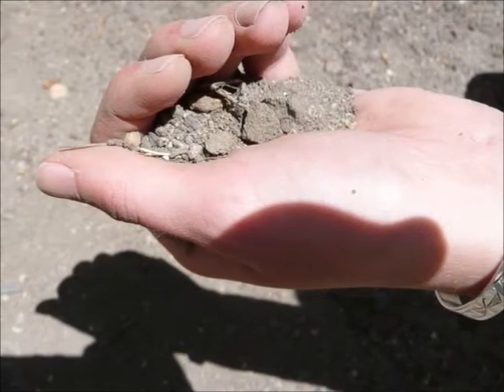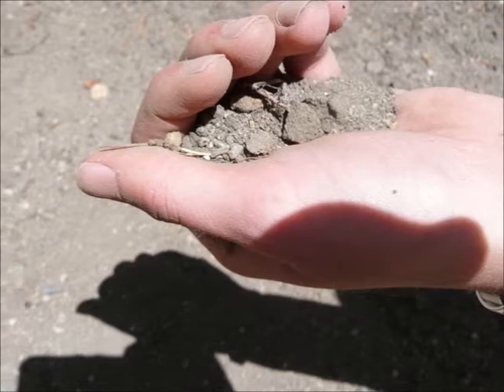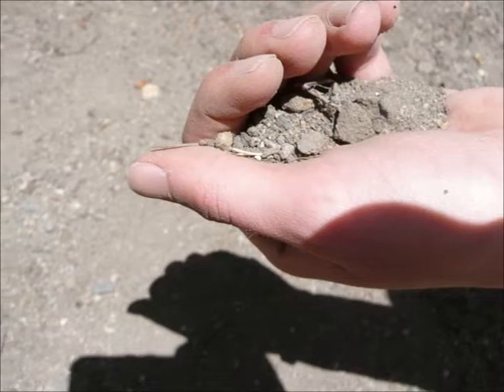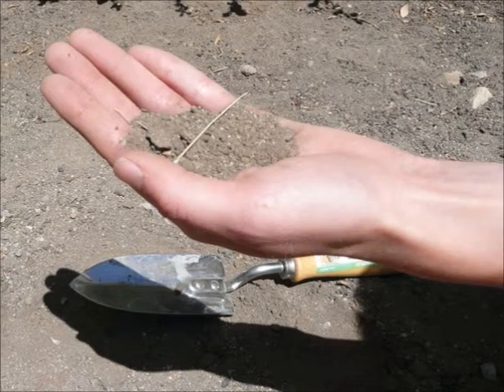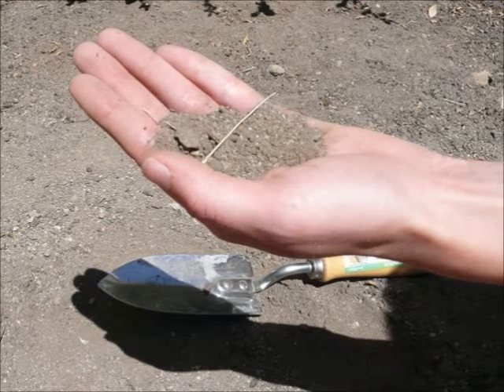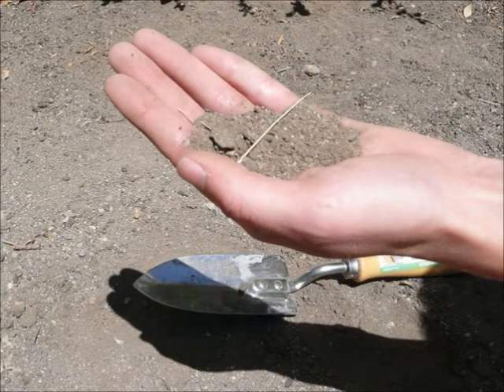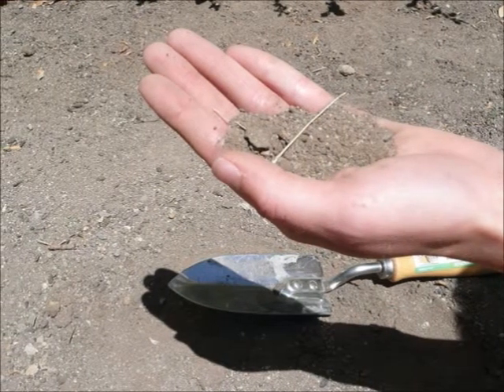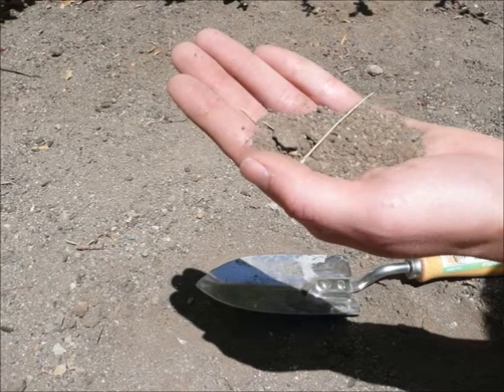Second, squeeze the soil sample firmly in hand to form a ball, and if possible, squeeze the sample out of your palm in efforts to create a soil ribbon. Finally, observe the soil's ability to ribbon, the firmness, the roughness, water glistening, loose particles, soil staining, and soil color, and compare all of these attributes with the available charts through the NRCS.